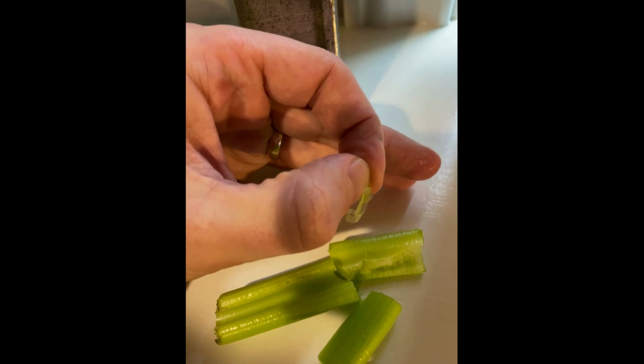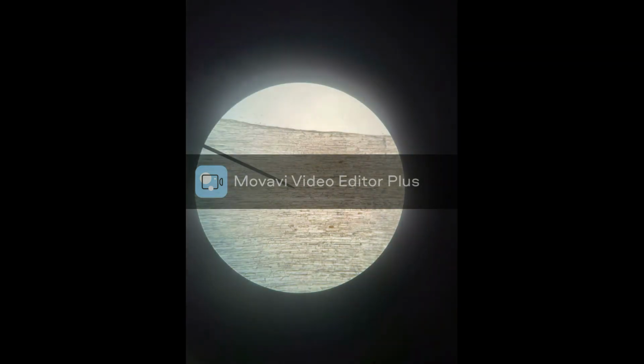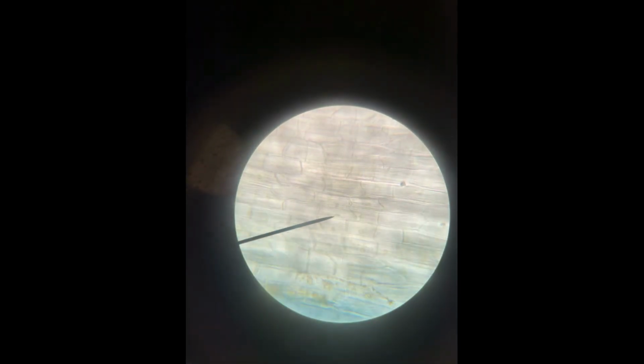And I didn't dye the celery this time, but we'll take a close look at some celery as well. You can see how I peel it nice and thin, and you can see it under our microscope. Halfway zoomed in there, and we'll zoom all the way in here, and we can see some features of those cells, and we're going to take a closer look with the still images.